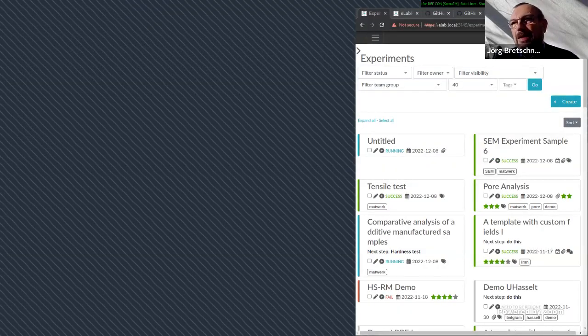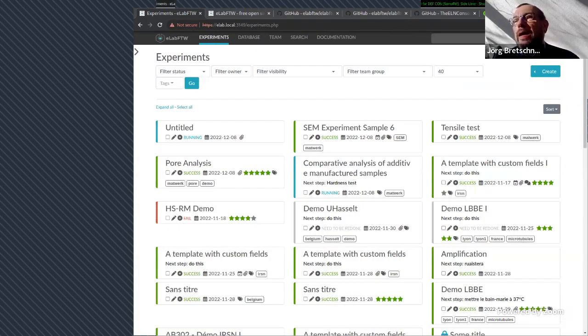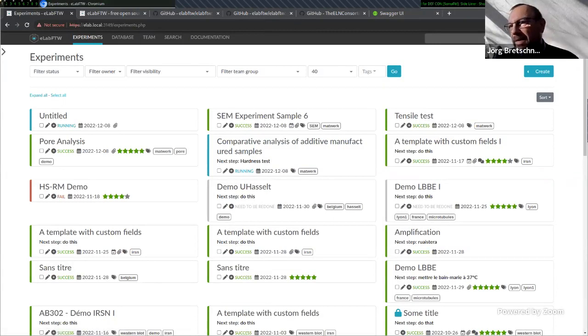Okay, Nicolas, thank you for keeping to your time scale. We had a look at our agenda and saw that we had a little bug in it, so the consequence is we have enough time for questions, maybe 5 minutes more on each ELN.